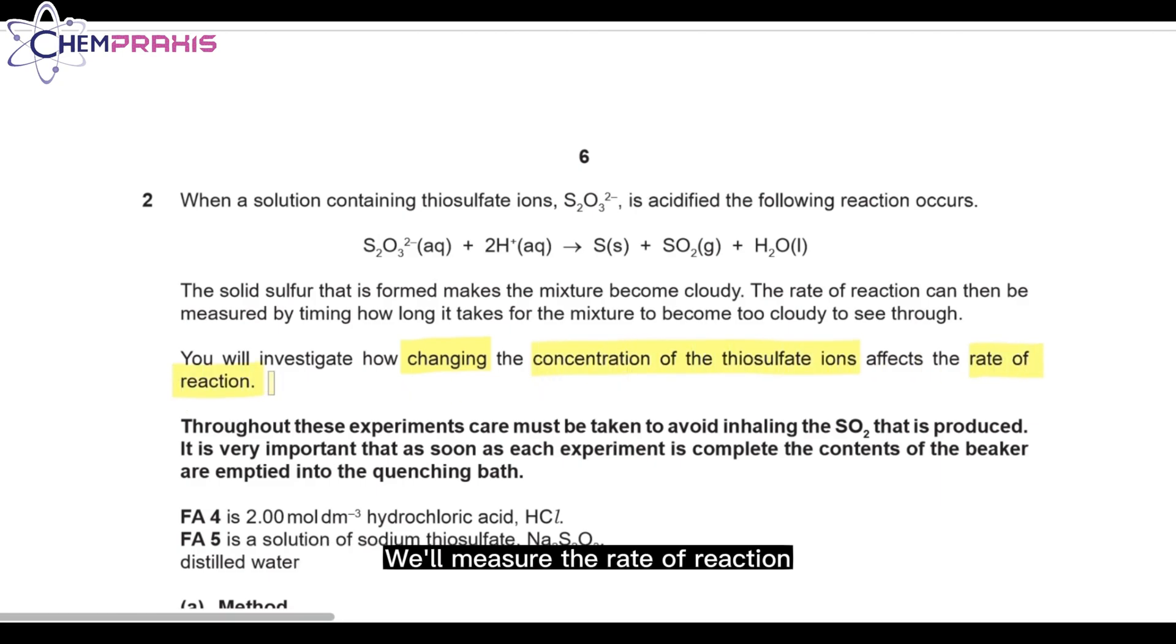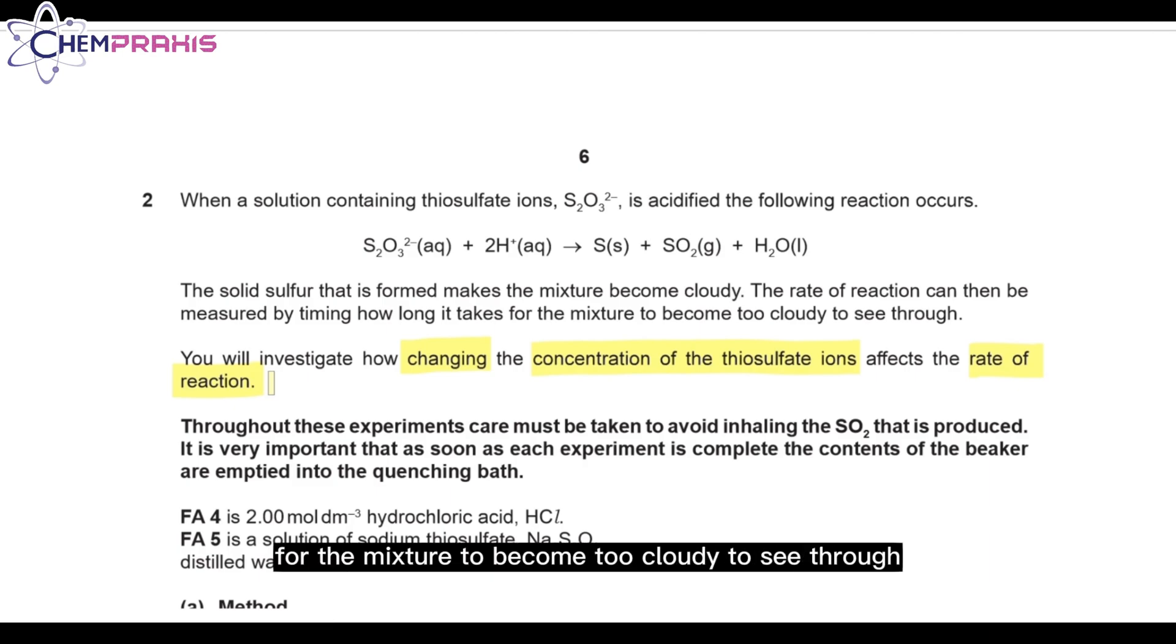We'll measure the rate of reaction by measuring how long it takes for the mixture to become too cloudy to see through. Take note that this reaction will produce some sulfur dioxide gas, so make sure that you empty the contents of the beaker into a quenching bath after you're done with the experiment.